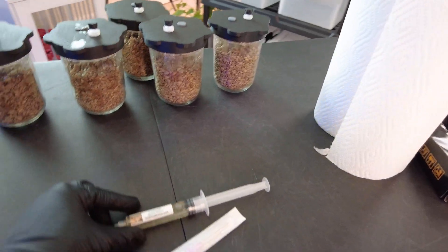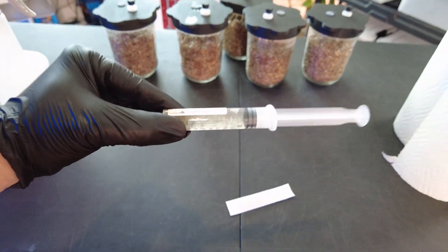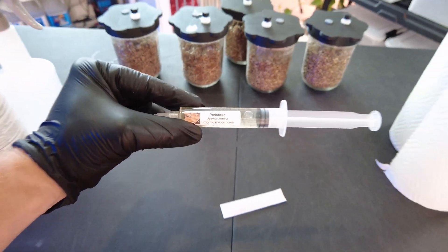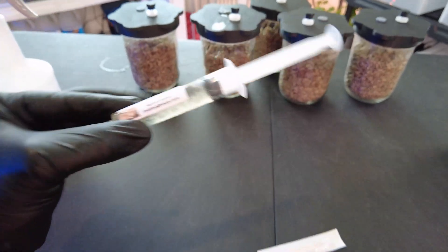In order to inoculate these grain jars we're going to use what's called a liquid culture. This is our button mushroom liquid culture — it says portobello on there. Button mushrooms are actually cremini mushrooms as well as portobello mushrooms, as I covered in part one. This liquid culture is what we're going to use to inoculate or impregnate these grain jars that we prepared.